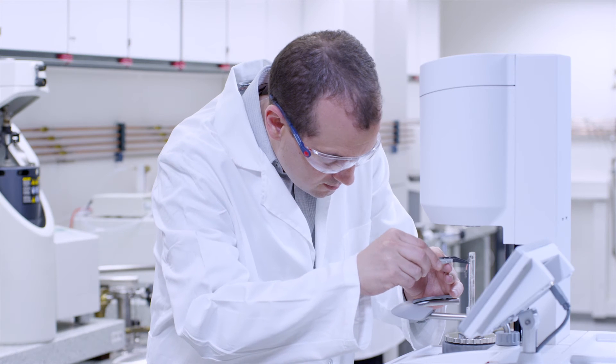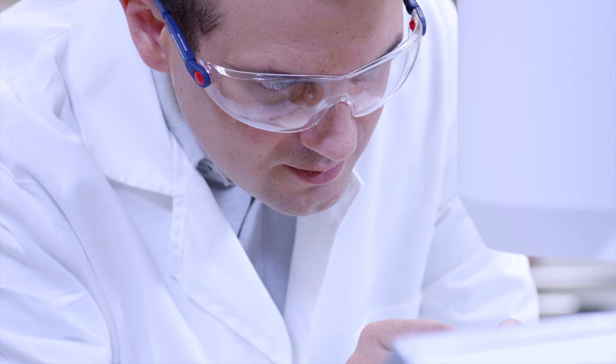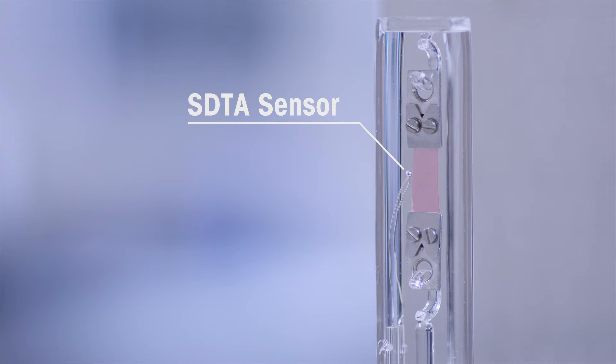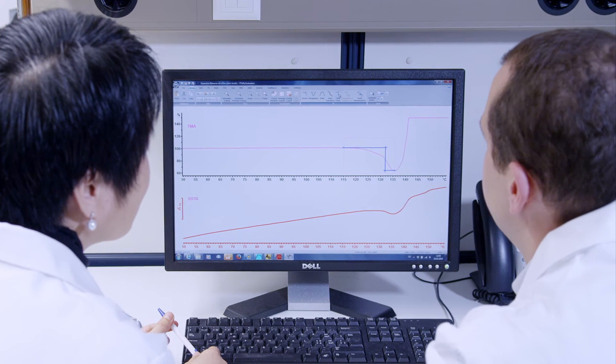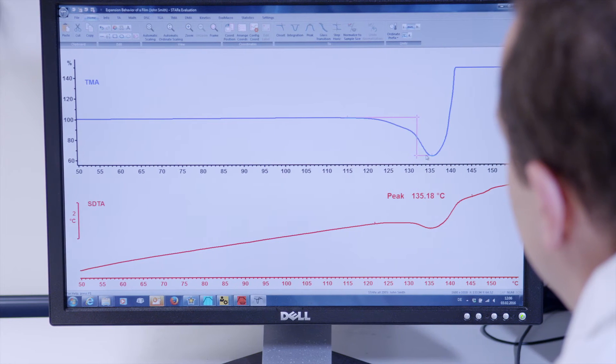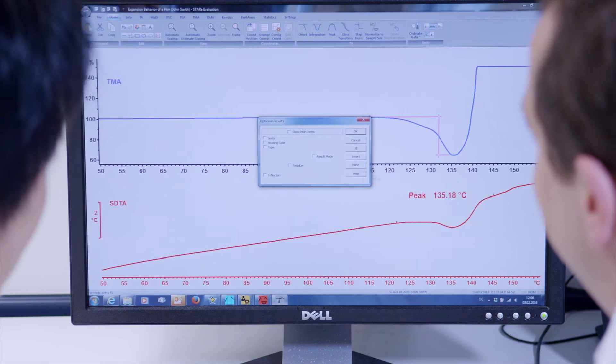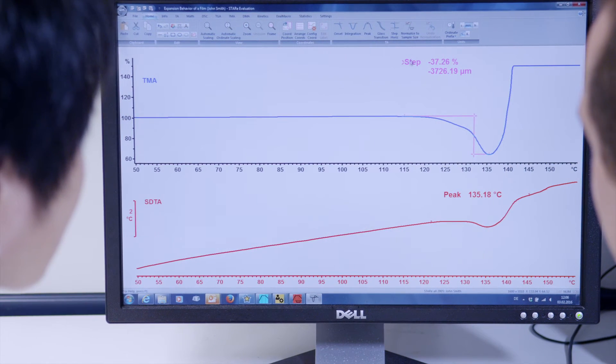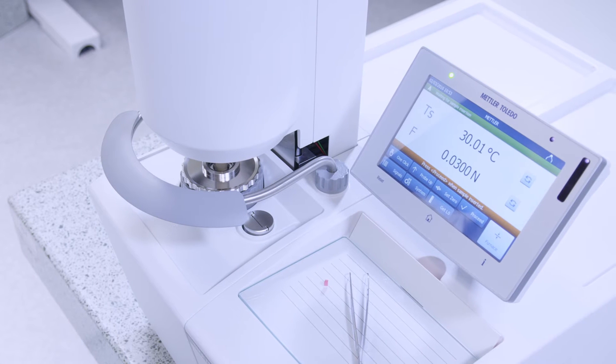The TMA-SDTA2 Plus measures the temperature very close to the sample. The resulting SDTA signal guarantees unsurpassed temperature accuracy and contributes to the correct interpretation of complex measurement curves.